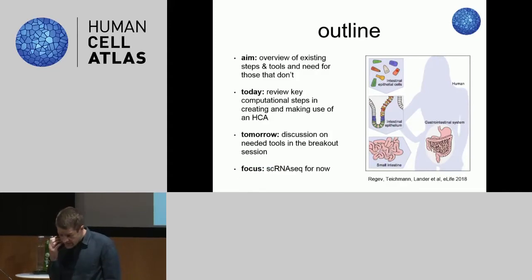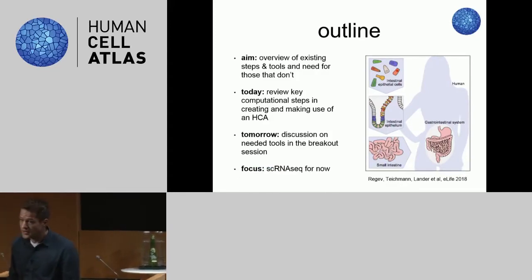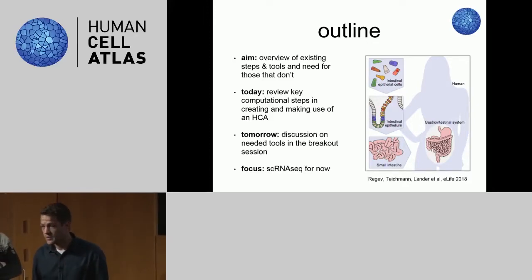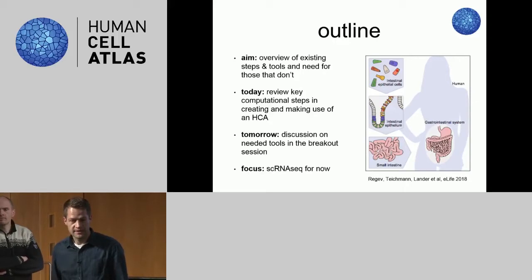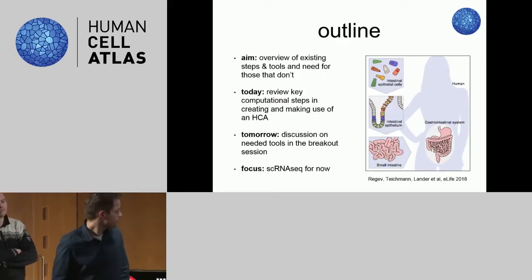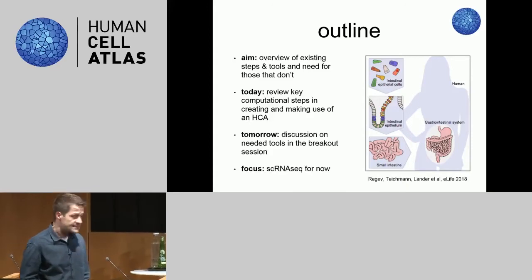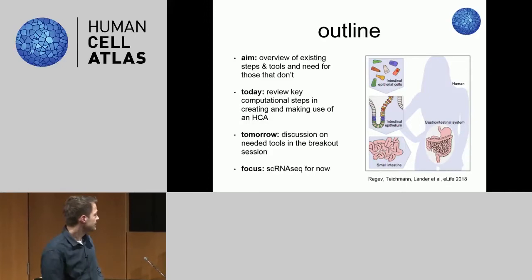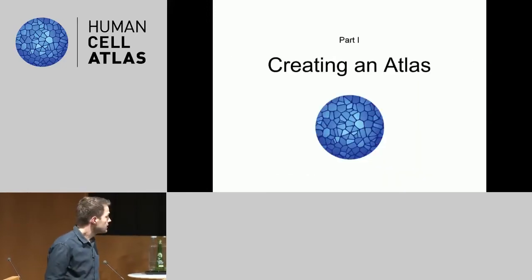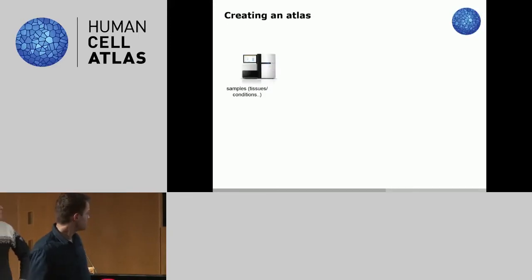Our task was to give you a little bit of an overview over the existing tools and also in particular then discuss with you what tools are not yet there that need to be developed. This will be particularly important for the next breakout session tomorrow. So today I just want to review a little bit these computational steps for making and then also making use of an atlas. Today I think we'll focus mostly on RNA-seq since there's not so much imaging data available.